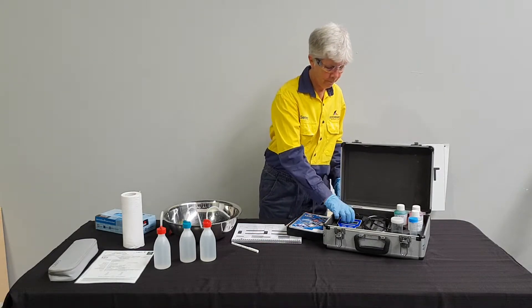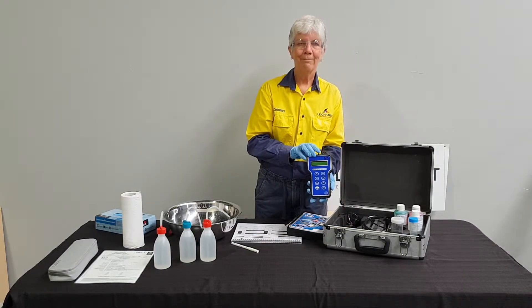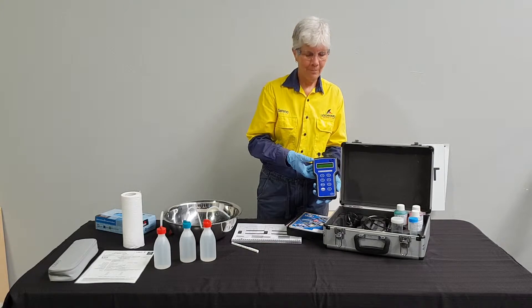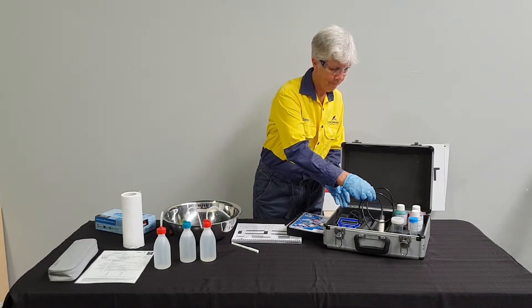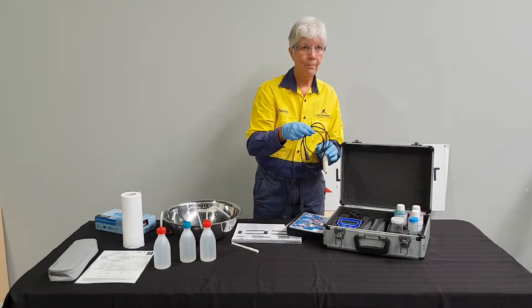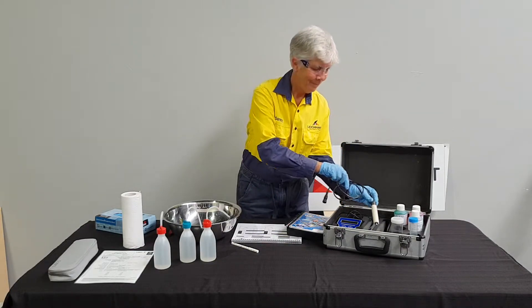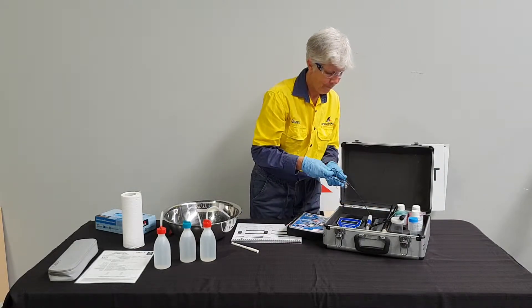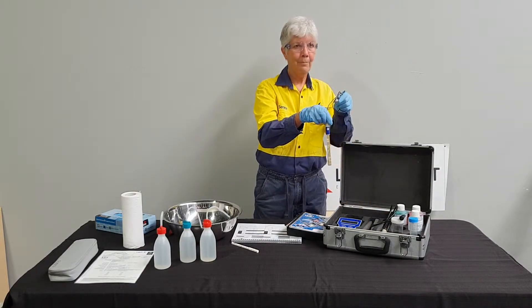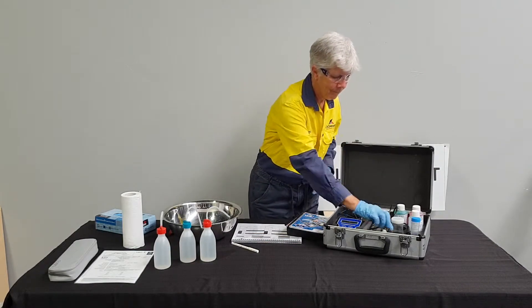Serena is now going to hold up the WP81 meter. Probes connect to the meter. This probe is used for temperature and conductivity measurements. This probe is used for pH measurements. When in use, probes are suspended in the kit using two pegs.